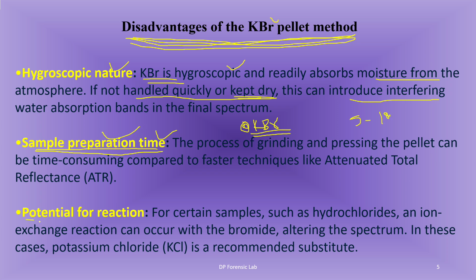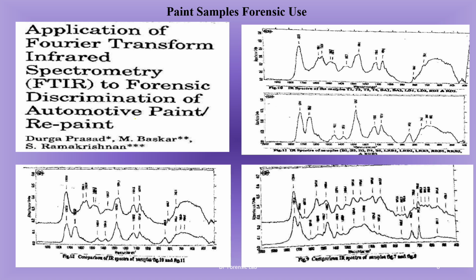Again, there is a potential for reaction. In some cases, some samples may react with KBr or KCl. So this should be kept in mind. So this is a limitation, but taking the IR spectra in transmission mode, you will get a very good spectrum for paint analysis.